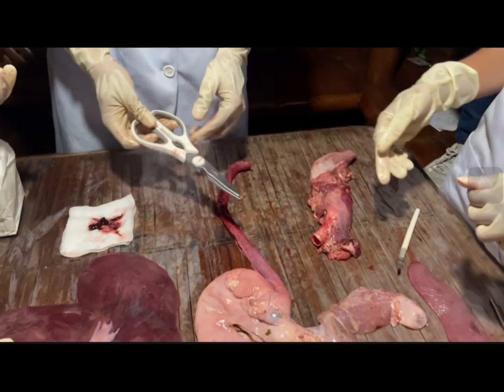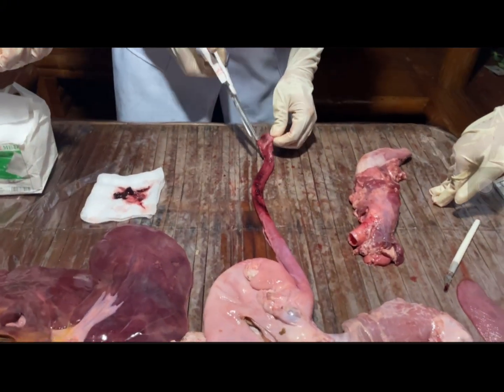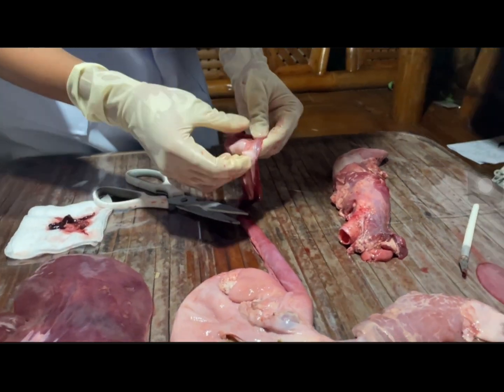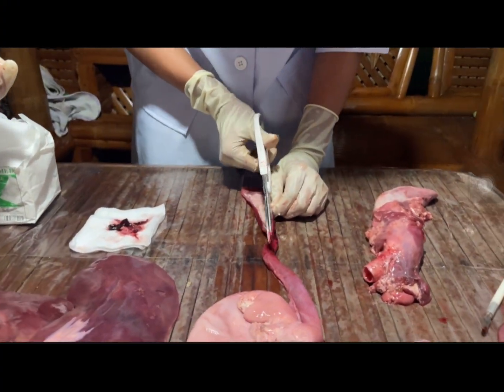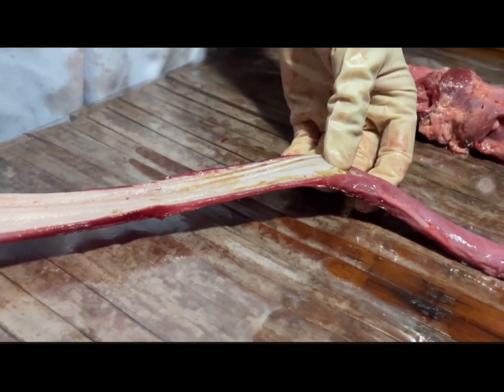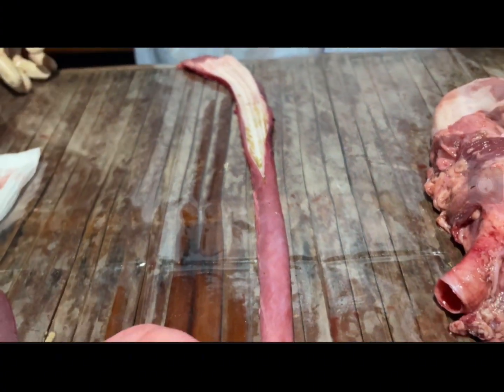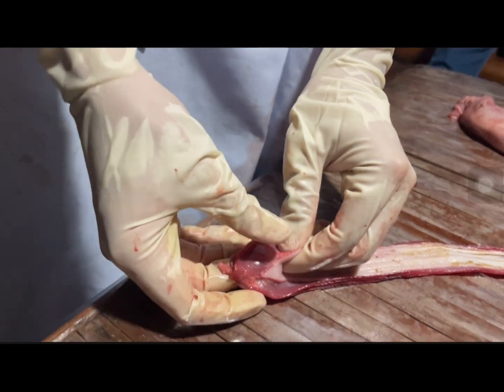Now let's make a longitudinal incision to observe the inner layers of the esophagus. We can see 4 distinct layers. The first layer is the mucosa. This inner lining is smooth and coated with mucus to protect against food friction and potential damage from rough or hard food particles. Next is the submucosa.